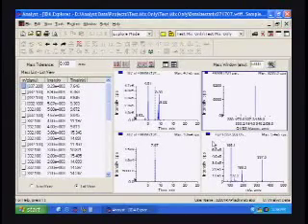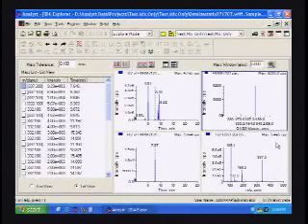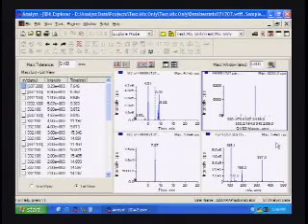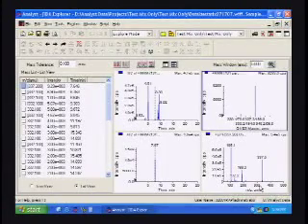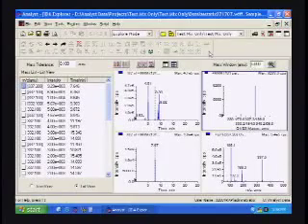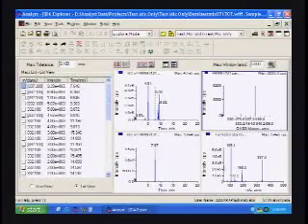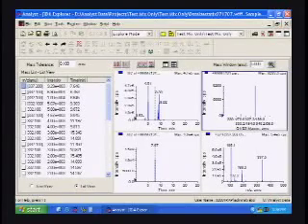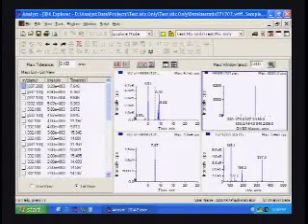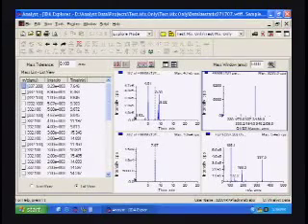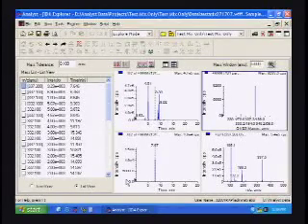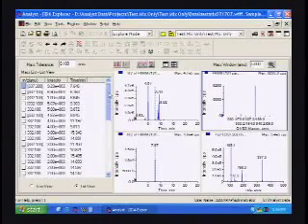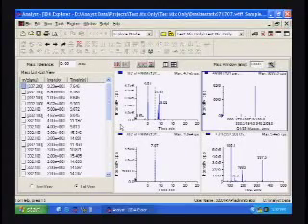In the bottom right corner is something called EPI, which means enhanced product ion scan. Enhanced just means we use the ion trap capability of the instrument. This is a product ion spectra, or a full scan mass spec for fentanyl as it's been selected and then fragmented inside the collision cell. This is the primary way that we analyze data in an IDA type experiment. An IDA type experiment is where we've linked one mass spectrometry experiment, MRM, with another type, enhanced product ion. We sort of put the data all together and use this screen to look at and process that data. So what we're going to look at here is a test mix, and the test mix has a number of components in it. I'm going to go through each one of those components, explain why it's there, and tell you whether or not this instrument is ready to have actual case samples run on it.